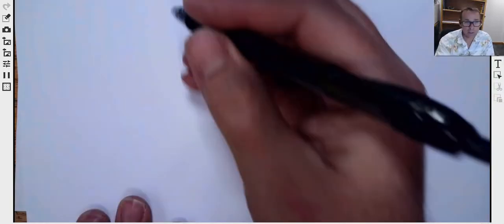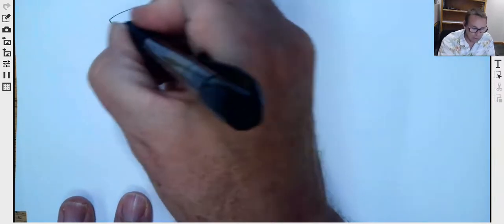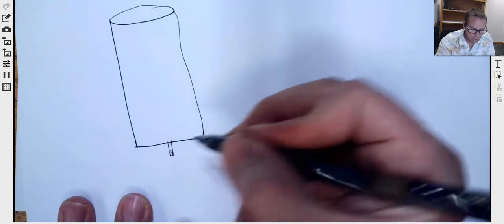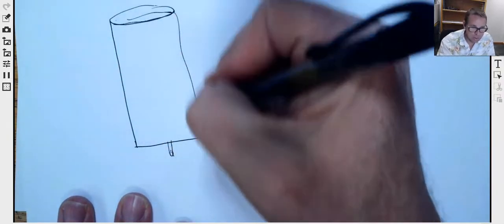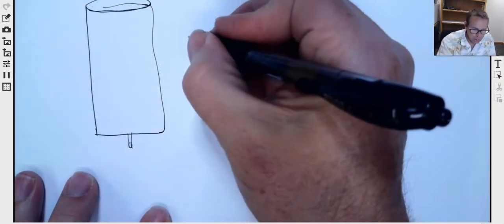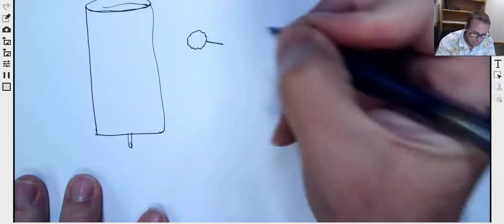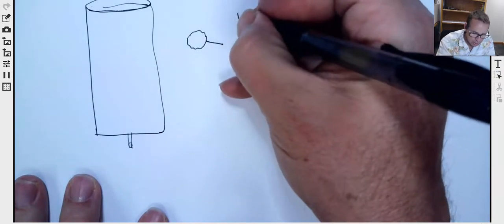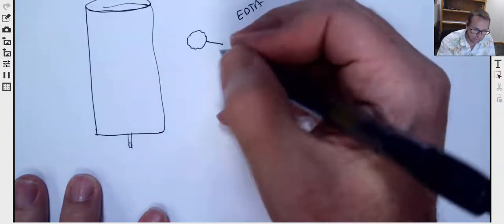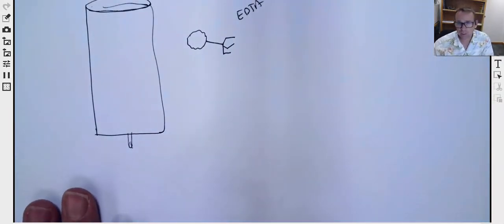So when we have our nickel resin, what nickel resin refers to, or the product that we have, usually resides in some sort of a column, right? And the nickel resin in this column here, if we were to draw a little cartoon of it, it would be some sort of plastic material, and on the surface would be an EDTA moiety, EDTA, covalently attached to this little piece of plastic here. So we'll draw this EDTA moiety kind of like a little claw, all right?